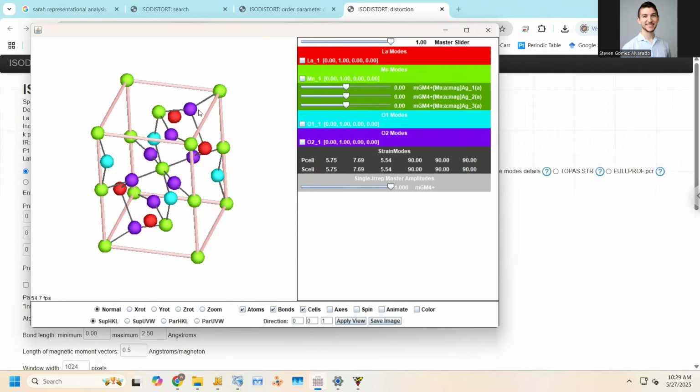And you'll also see the coefficients of all three of these modes. So if one is 100% and the other two are like 10 and 10, you might just say, hey, this is the only mode that's really strong. Maybe these other two components aren't actually important. Okay, so we'll see that in a second.